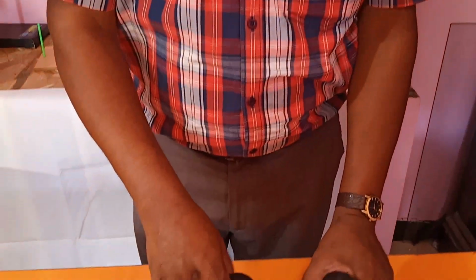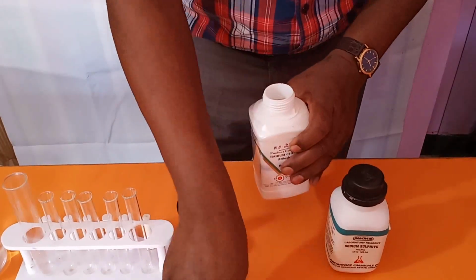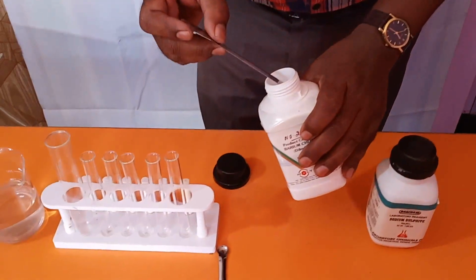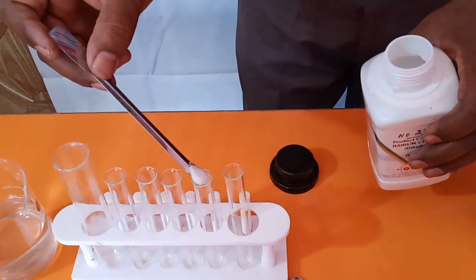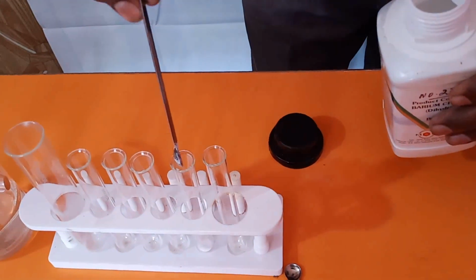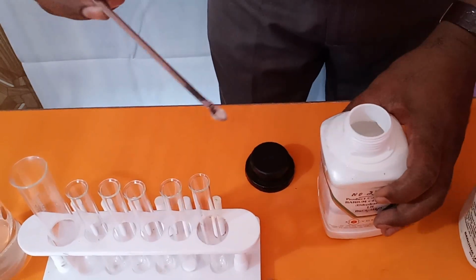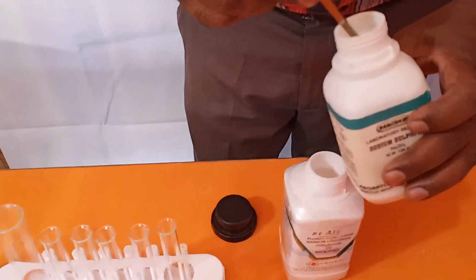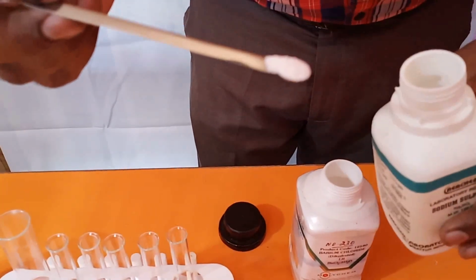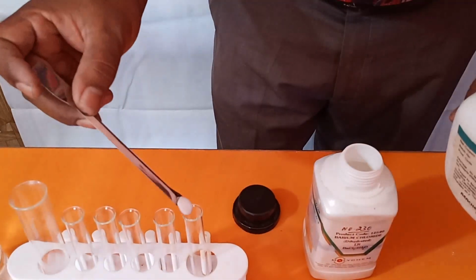Now I am going to add this barium chloride to one of the test tubes. Look at the color, it is white. I'm adding this to this test tube here. This is barium chloride, right? Now let me take this sodium sulfate and add it to the second test tube. This is also white.